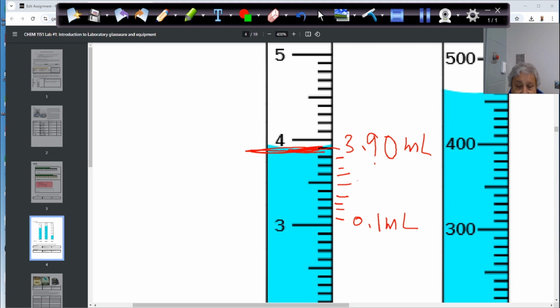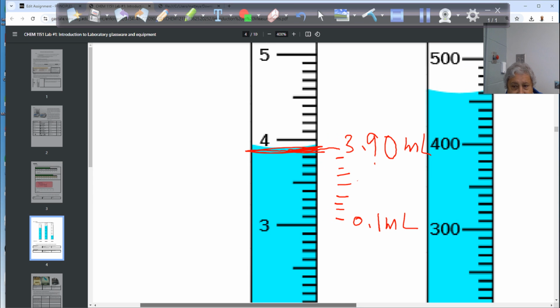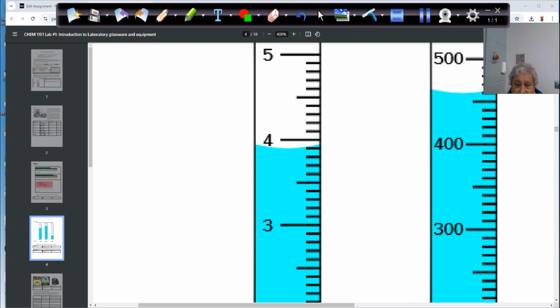Correct, guys? Let's take the second one. So I'm taking them higher, so well, it looks like I will lose this one. Let's take this one here, take a snapshot of it if you want, and then let's go for the second one. I'm just deleting this one here, go for the second one.